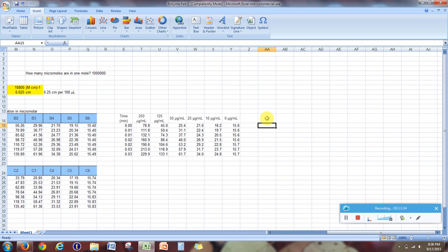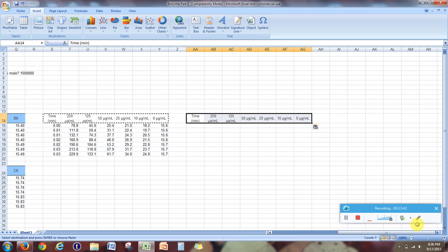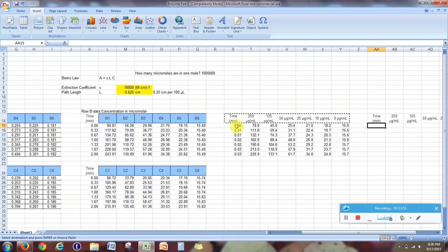So this is also pretty simple, and I'm just going to copy this over. I'm going to keep working off to the right side here. Paste. And then I'll just copy these. Now, one thing I just noticed, and maybe you noticed it as well, see my times are all messed up now. Here they make sense. Here they're messed up. Why is that? Well, if I double click on it, you see it's pointing back at this 2 again.